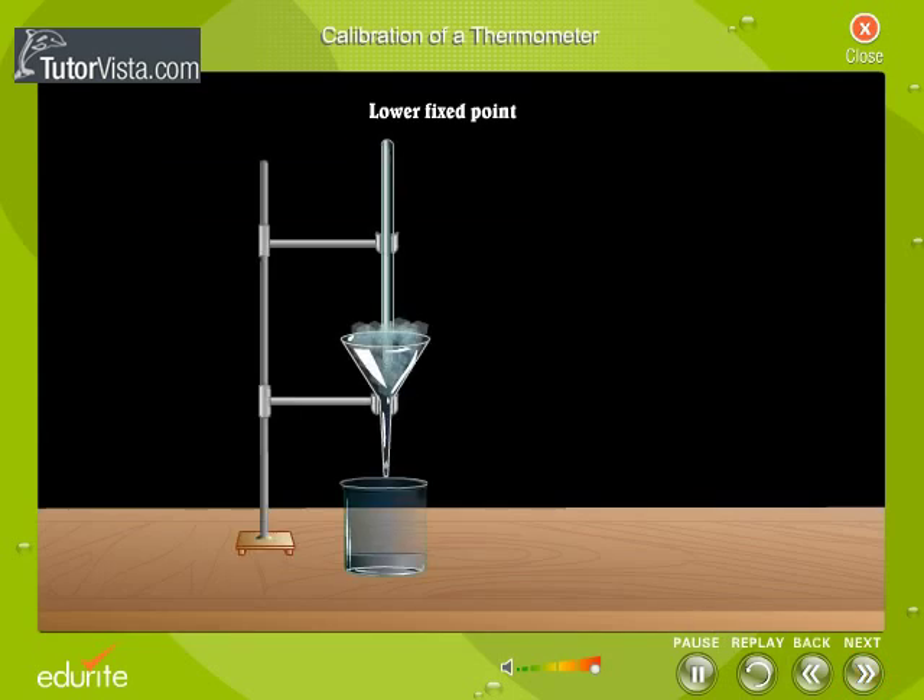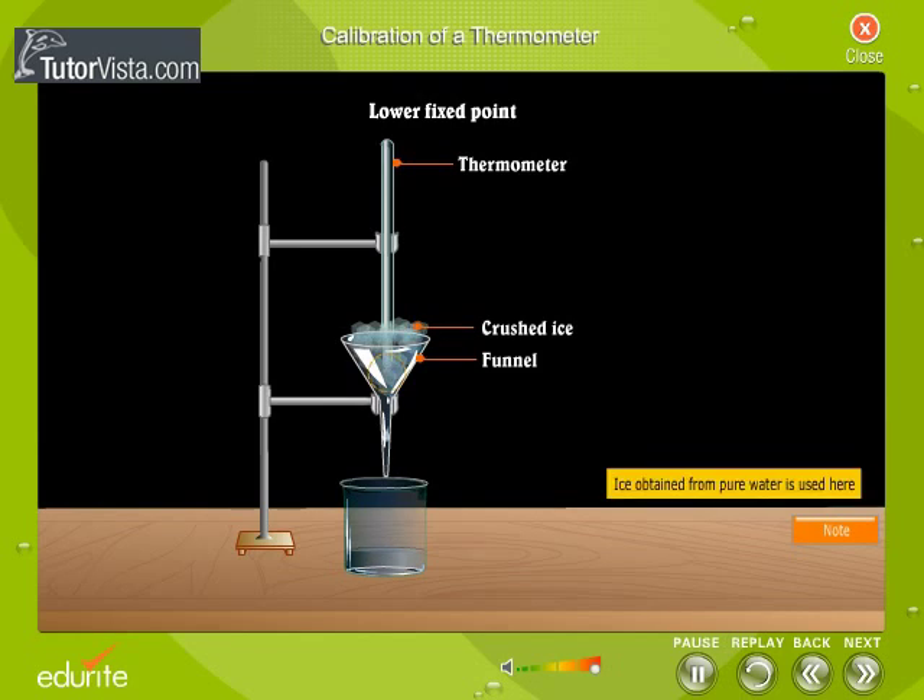Let us see how the lower fixed point is marked on a thermometer. The thermometer which is to be calibrated is placed in a funnel surrounded by crushed ice. The bulb of the thermometer is completely immersed in ice. A beaker is kept below the funnel to collect the dripping water.